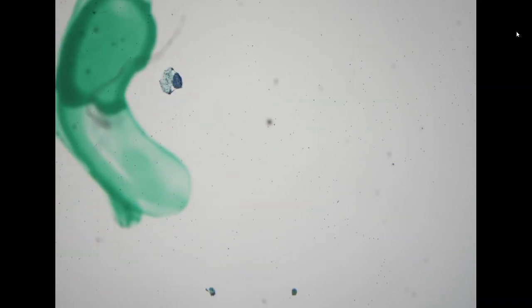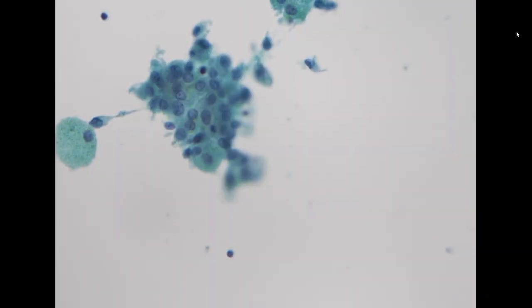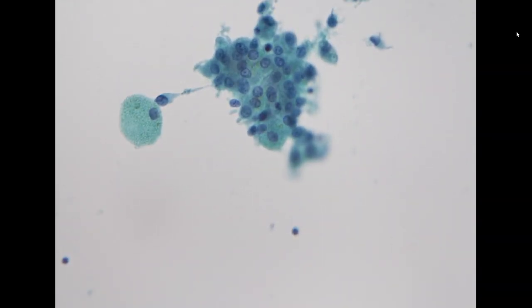For the direct smear, we see aggregates of histiocytes. These are all histiocytes. These are not epithelial cells. Sometimes histiocytes can aggregate together in a cluster and make you think, okay, could it be epithelial cells?